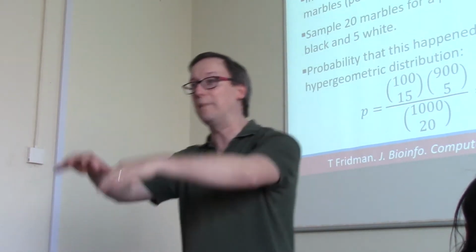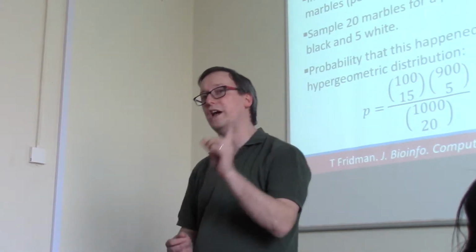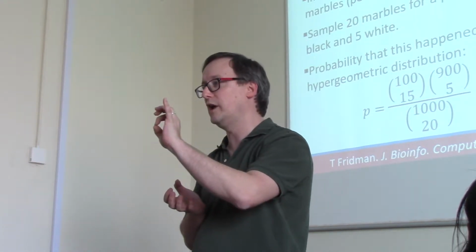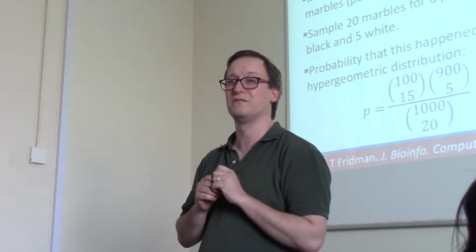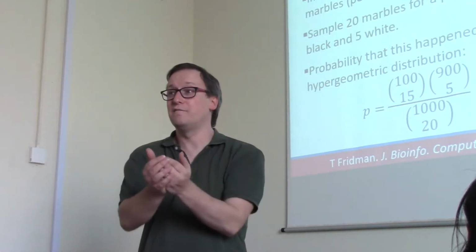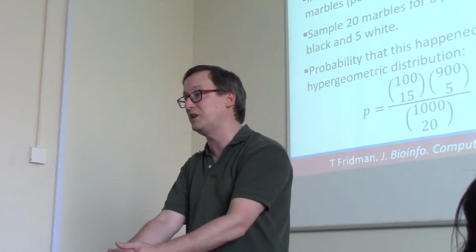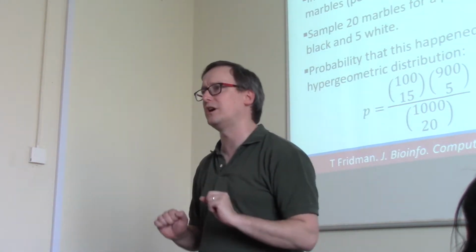Now, we have a population from a statistical point of view. We are now going to draw out the marble corresponding to every mass to charge value at which we should have a peak if this were the correct sequence. So pull that out, pull that out, pull that out, pull that out, pull that out. In this case, I have a jar of marbles that has 1,000 different locations where I could have peaks. 100 of them are places where I actually saw a peak.